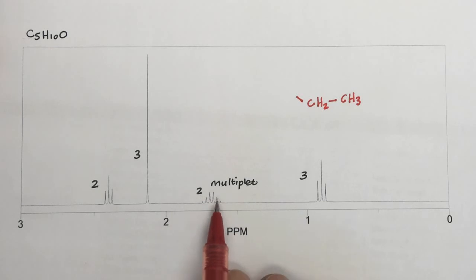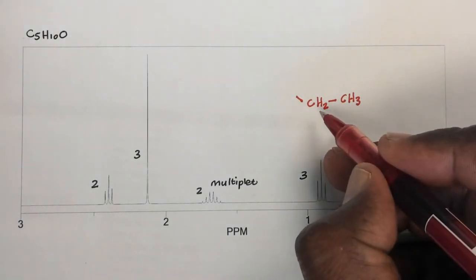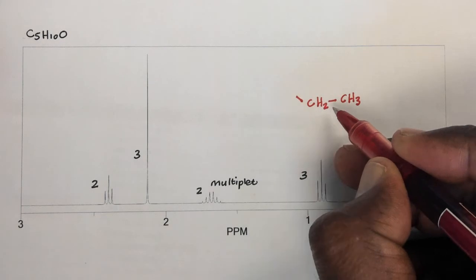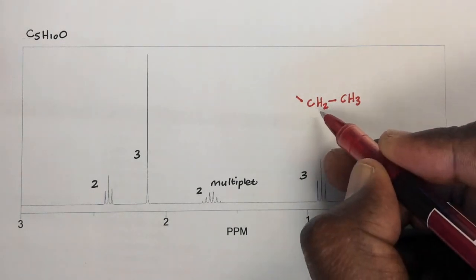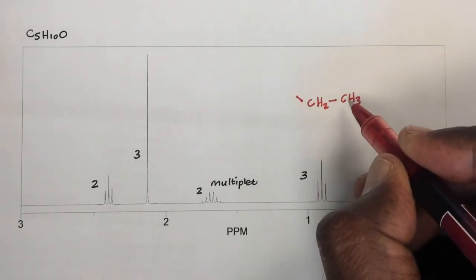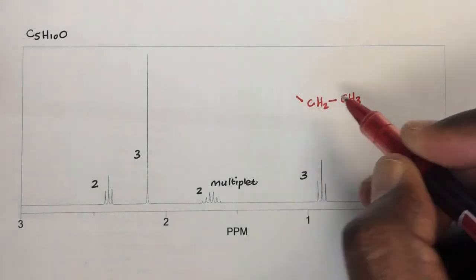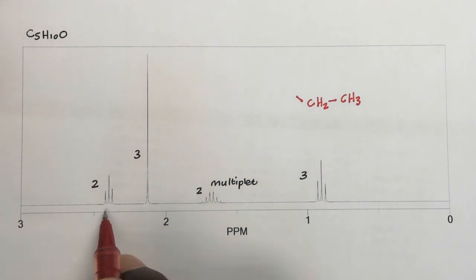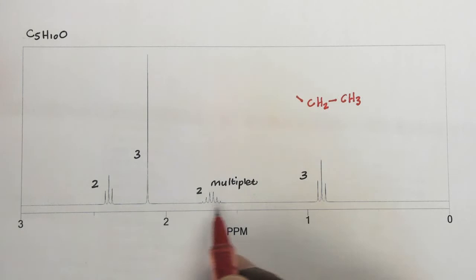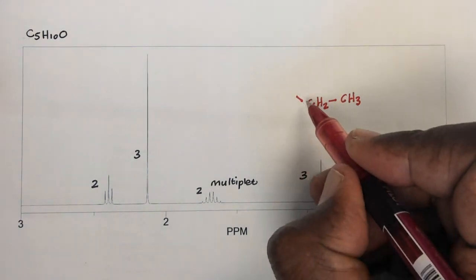This is a multiplet, which means that there are many lines in this resonance. So the CH2 also cannot be a triplet, because it is already a quartet, and if there was something else here, that quartet would get split into something bigger, so it can't be split into something smaller. So this CH2 group isn't this triplet that you see slightly deshielded. In all likelihood, this CH2 group is this multiplet here, which means that there's another protonated group attached to the CH2.